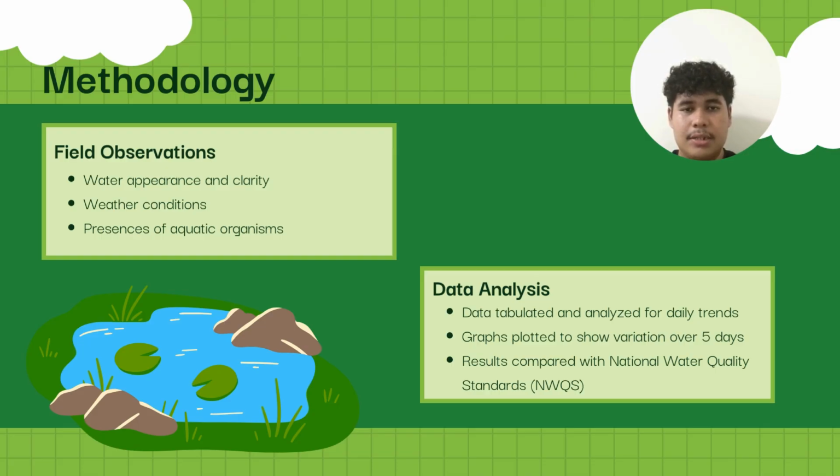The data analysis. The data will be tabulated and analyzed for daily trends. After that, the graph will be plotted to show variation over 5 days. And lastly, the results will be compared with National Water Quality Standards (NWQS).